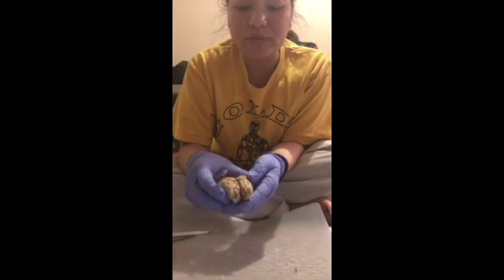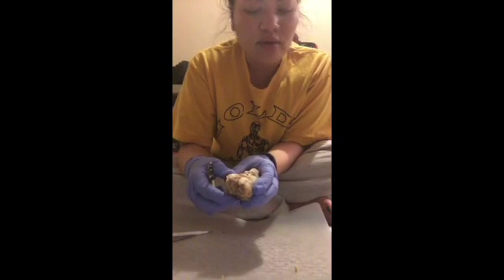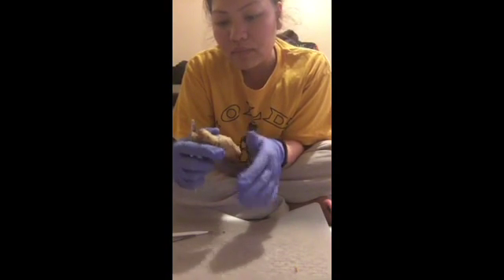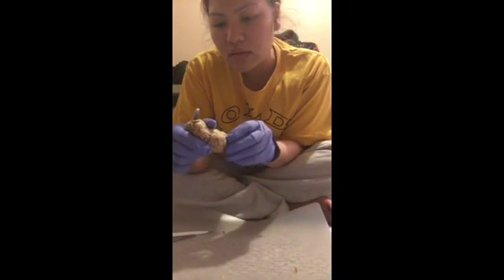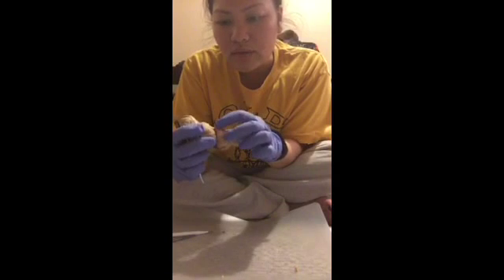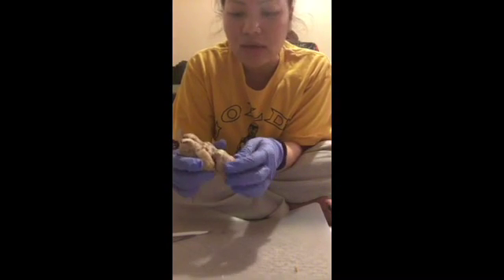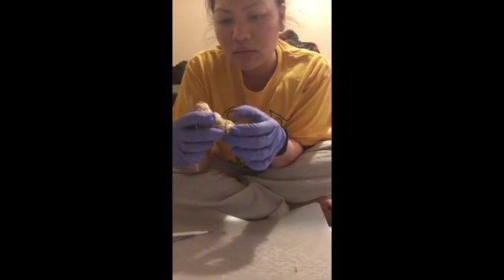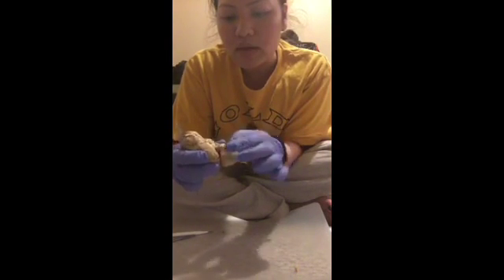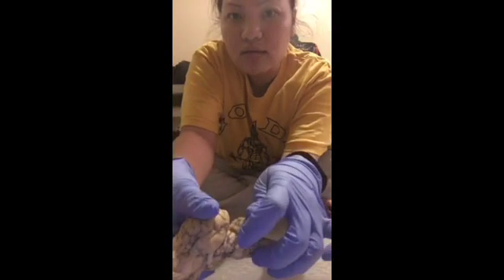And the cranial nerves. Now, okay, this is the optic nerve. I showed you the optic nerve. And then the oculomotor, somewhere right here. Then the trigeminal, this is the trigeminal, right here. What's that little one?